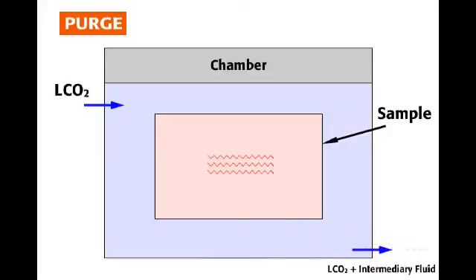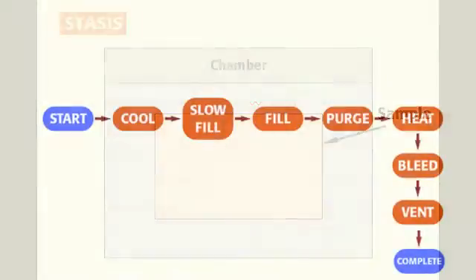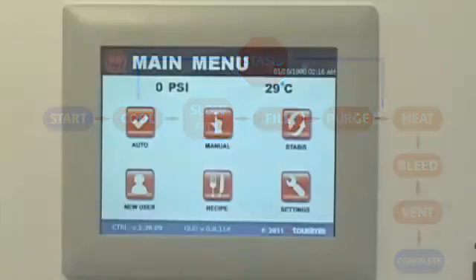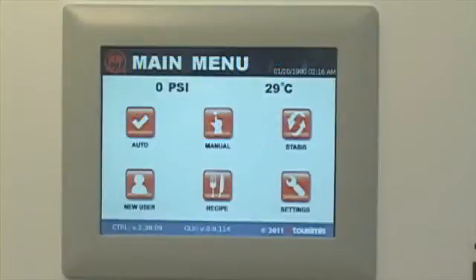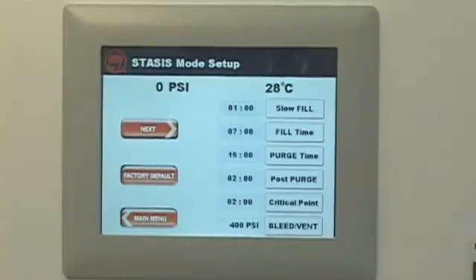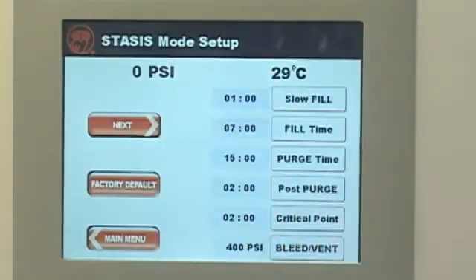The stasis mode is essentially an optional extra phase that has been added to the run that allows the sample to sit in the chamber for a selected amount of time, and to cycle through the stasis phase for as many cycles as the operator deems necessary. So the time in stasis and the amount of times going into stasis are fully programmable. If the operator has a sample that will need the stasis mode, it can be selected from the main menu. The user is first allowed to customize any standard run parameters, or just choose to enter the stasis programming.